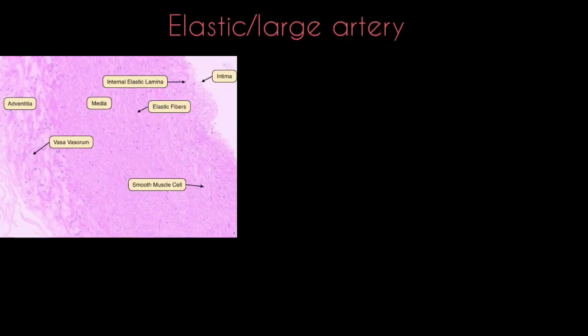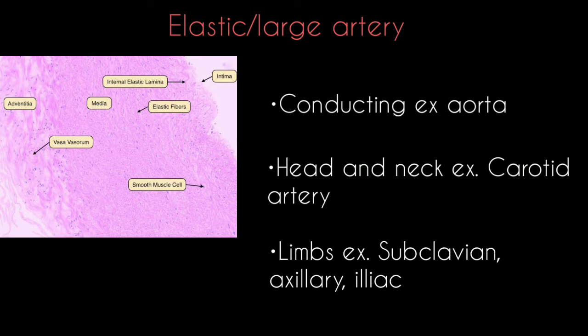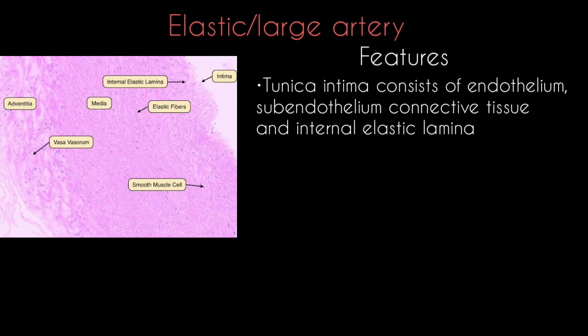We will look at histology slides identification, starting with the cardiovascular system. Elastic arteries are also called large or conducting arteries. They supply the head and neck — example: carotid artery — and limbs — example: subclavian, axillary, and iliac artery.